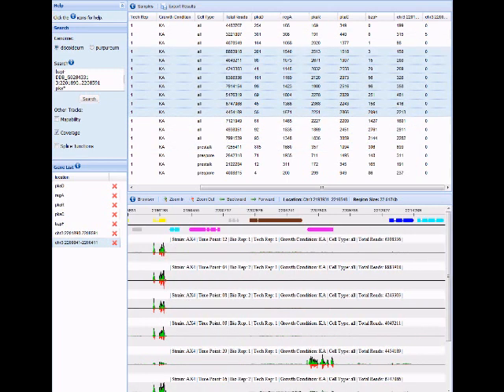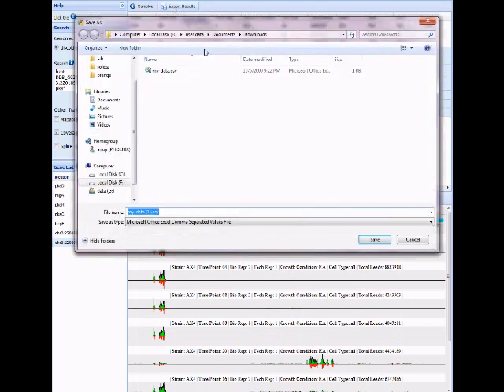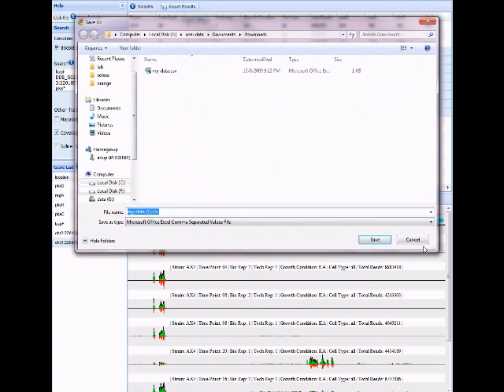Once you're done exploring these data, you can download the entire samples panel to Excel by clicking on the Export Results button, which will open up a window to save the file on your desktop.